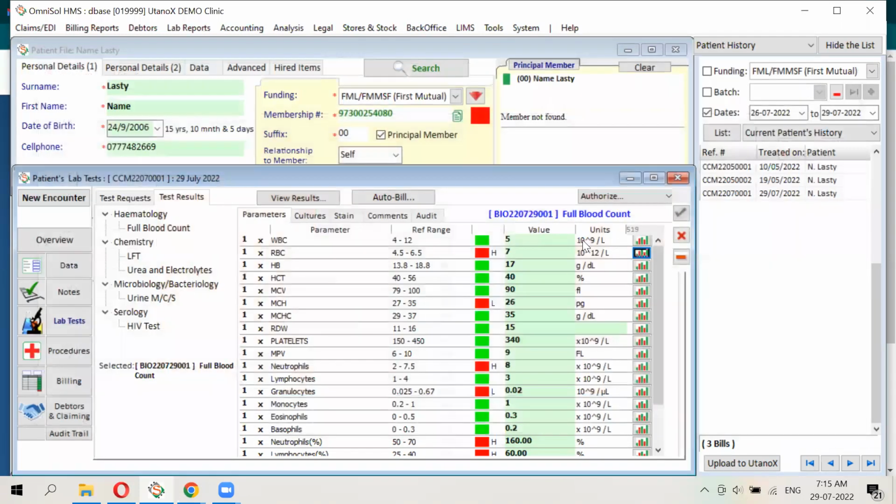Okay. Yeah, because definitely the previous result is important, and someone would want to see it. Okay, then now I've seen a bit much. Let's go to the billing aspect of it.